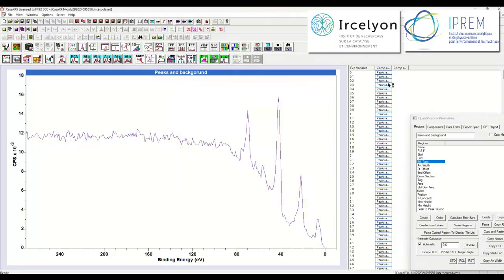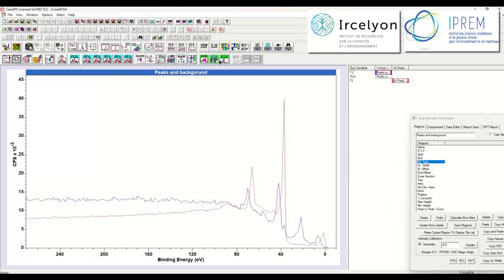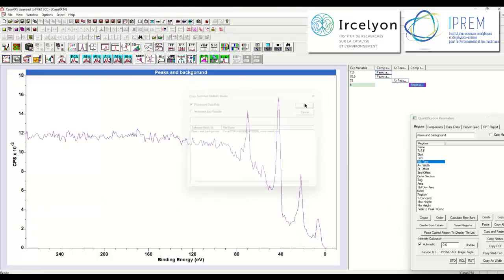Copy that, and let's move the VAMAS block I've calculated here into the file representing the component spectra. So the combination of these two VAMAS blocks has produced this third one here.